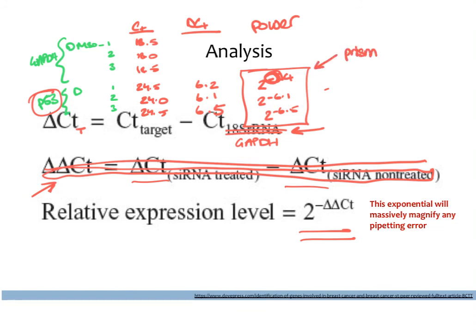But remember that we talked about how qPCR is a relative tool. And it is not very helpful to tell someone that my DMSO expression is 0.05 and my TMZ expression is 0.005. That's really hard to interpret.